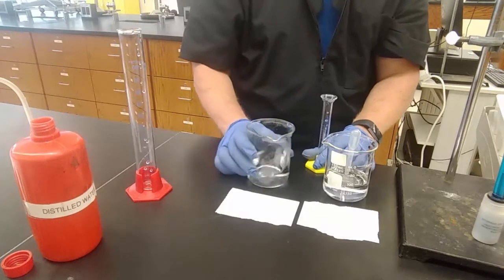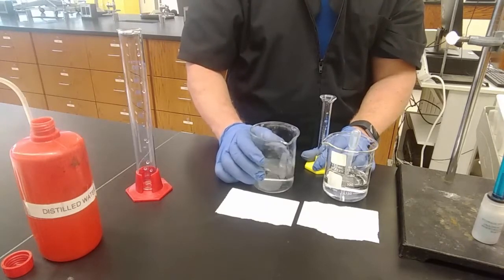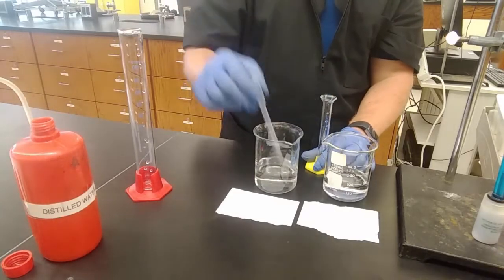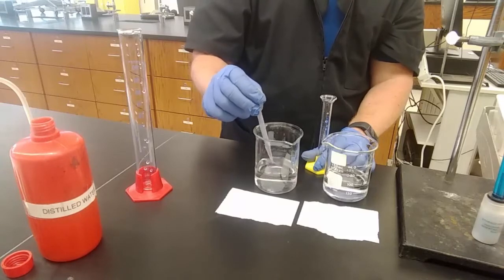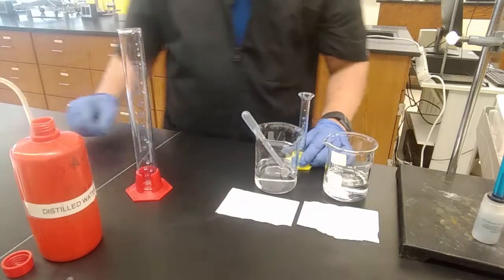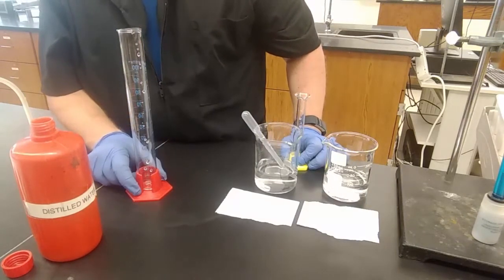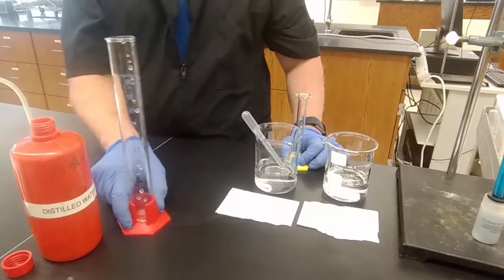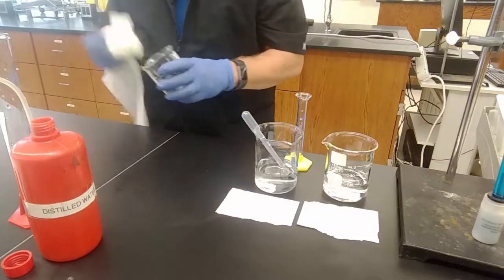And it needs to be mixed. Just because I know I'm going to be using it next, I'm going to stir it with the pipette as well. All right, so that's pH 1. Then I'm going to get a third 250 milliliter beaker. That's pH 1.